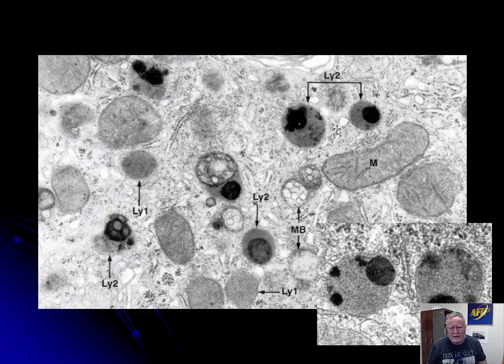Fat's a very interesting thing on EM. The processing of tissue for paraffin embedding removes all the fat. Okay? So if you're taking tissue out of paraffin, the fat in that tissue, if you're looking at a liposarcoma or something, it may stain just totally clear because all the fat's been removed. It may stain incredibly black. If you did it properly and you're using a real EM fixative, it's going to be very black. Osmium just sticks to fat or anything that contains fat or fat breakdown products.